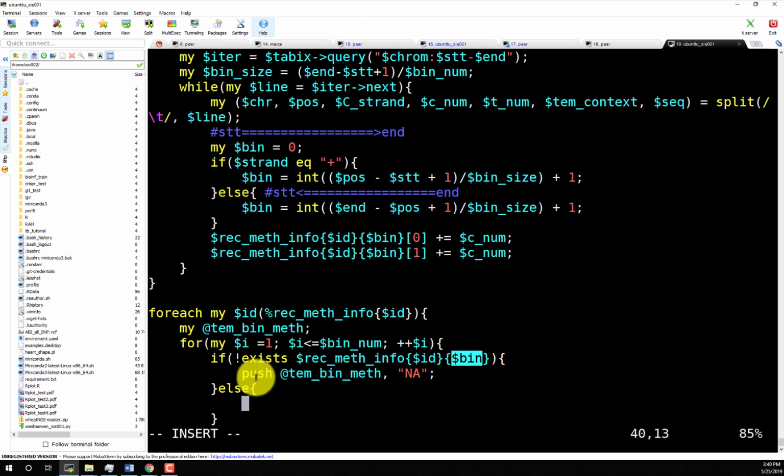Okay, let's say we have the C number and we have the T number.